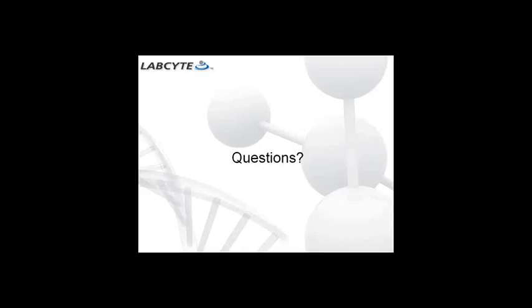So that actually is the next question, which is on the reader. There's not any specific, you said commercially available readers? Yeah, so we use the BMG reader to read the luminescent-based assay. So there's no special plates, no special readers for these assays.